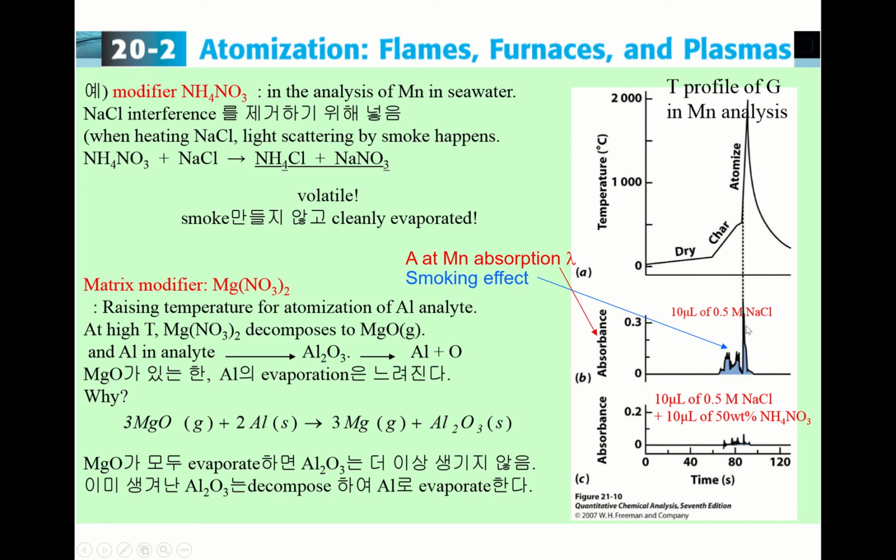And this figure P is the absorbance with respect to time. In this case, your sample is 10 microliters of 0.5 molar sodium chloride.